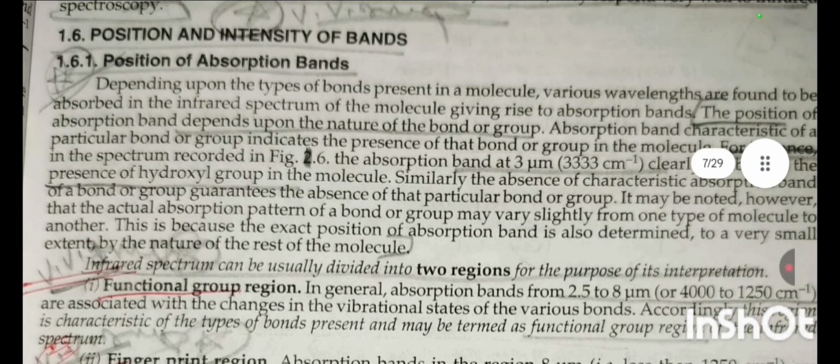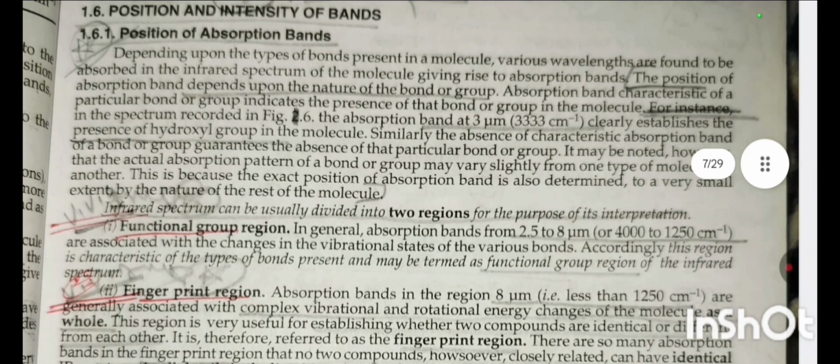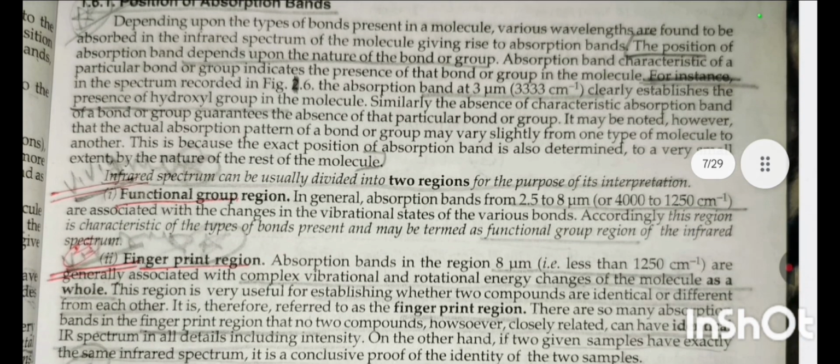Position and intensity of bands. Position of absorption band. Depending upon the types of bond present in a molecule, various wavelengths are found to be absorbed in the infrared spectrum of the molecule, giving rise to absorption bands. The position of the absorption band depends upon the nature of the bond or group. Absorption bands characteristic of a particular bond or group indicate the presence of that bond or group in the molecule.